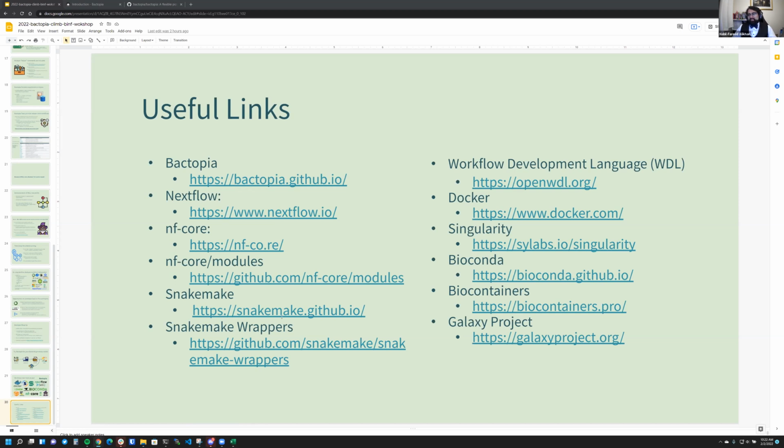So I mean, I've put the link to the GitHub in the Bactopia channel, please go have a look at it, because I think the platform, Bactopia as a tool, is very easy to install. It's very easy to just get up and running, get data sets down and start running analyses. Sort of your first pass of what you would want to interrogate, what Rob was saying, it's really, really good. But even if you don't, and just for the sake of it want to write your own thing, there's a lot of practices in there.